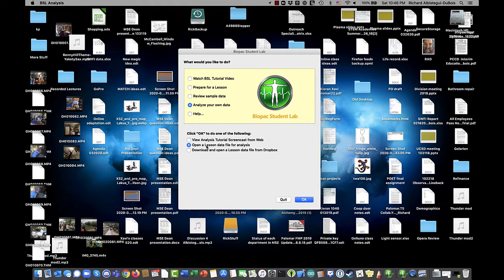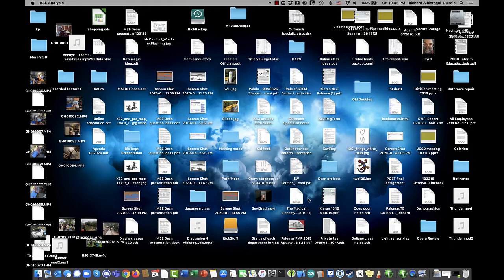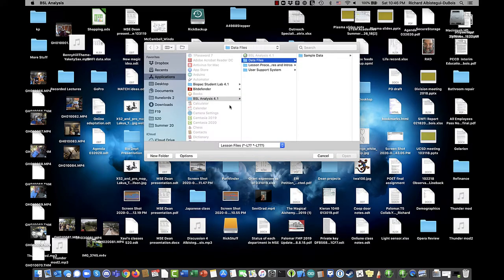We are going to open a lesson data file for analysis. Now, you should have downloaded the sample data for this lab 7A from the website. But if you haven't, we'll make sure you have a set of sample data to use. So I'll do that, and I will find my file.